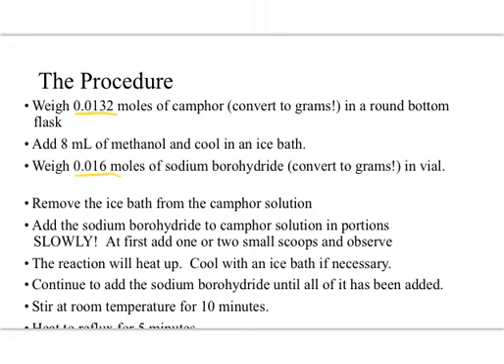All right, we want to make sure that we're going to keep this away from any potential moisture that could react with the sodium borohydride. So if it's a humid day, we have to worry about the sodium borohydride absorbing moisture directly from the air. It's a reactive intermediate, the sodium borohydride.